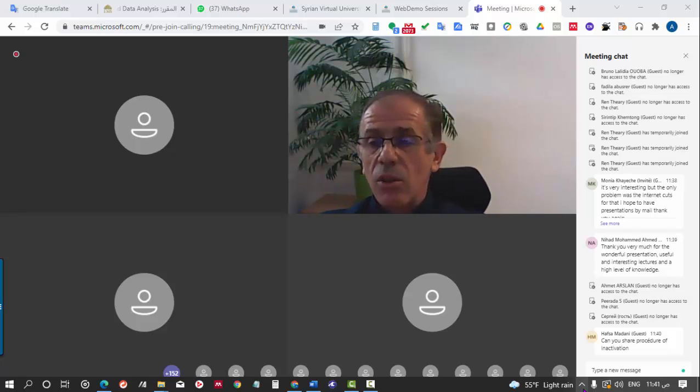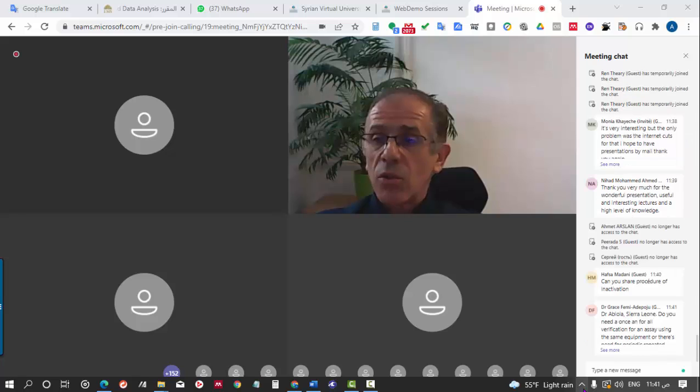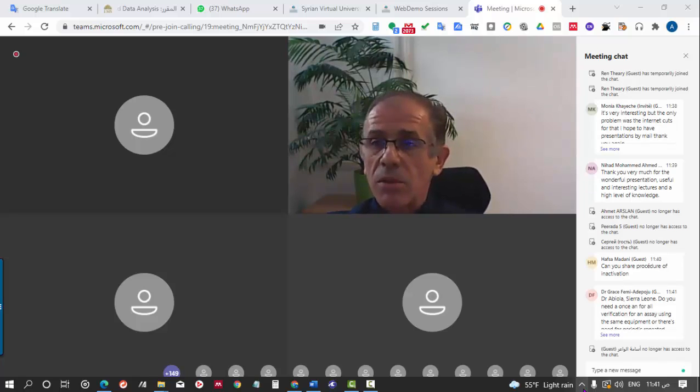It means that your uncalibrated machine gave good results in proficiency testing, and I don't see why the results should not be acceptable. But it doesn't mean that you don't have to calibrate. You definitely must calibrate your equipment.